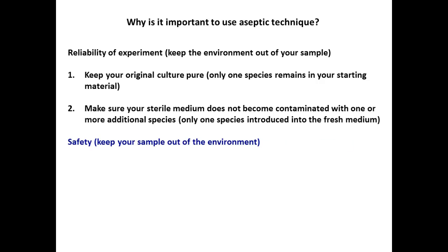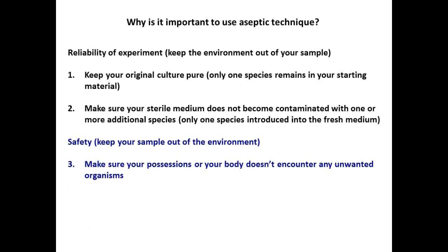Safety. We want to keep your sample out of the environment, right? So again, if we spill, we want to disinfect, right? We don't want to put our caps or our things down on our bench because it might have microorganisms on it that are going to then contaminate our bench, right? If we don't clean up, then it's going to get on our stuff and we're going to take it out of this room, right? Or someone else is going to come in and get exposed to it. So make sure our possessions, right, we put them away, so that we don't get unwanted organisms on stuff.